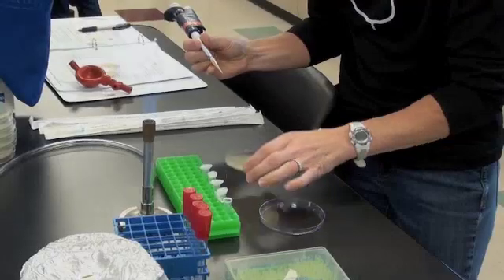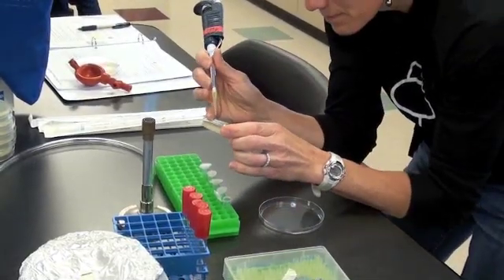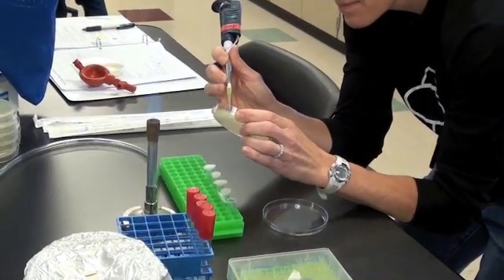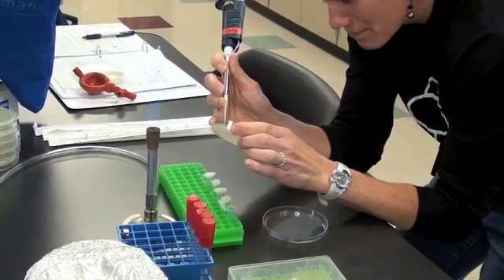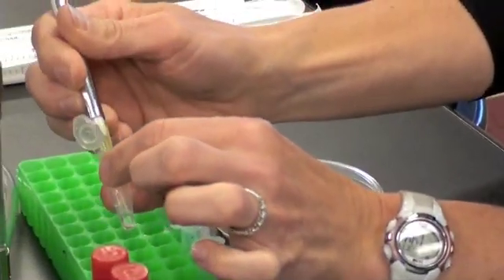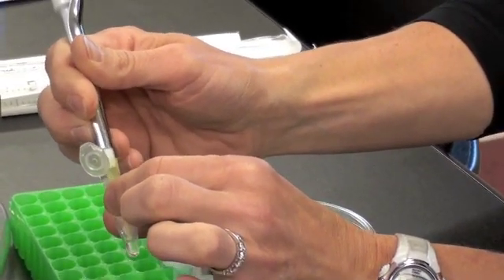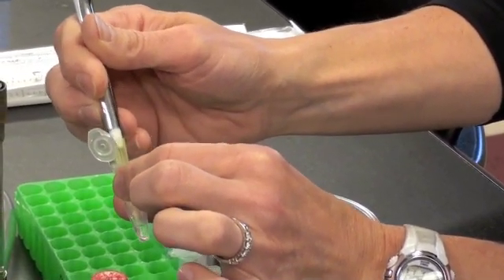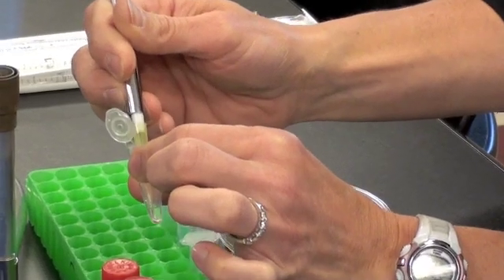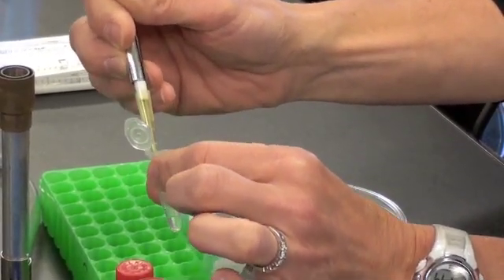The student is going to pick those plaque forming particles from her petri dish using a sterile micropipette tip. She touches the tip to the plaque and then places the tip in her phage buffer. Here she's moving the tip around in 100 microliters of phage buffer hoping that those plaque forming units will be transferred to the buffer.